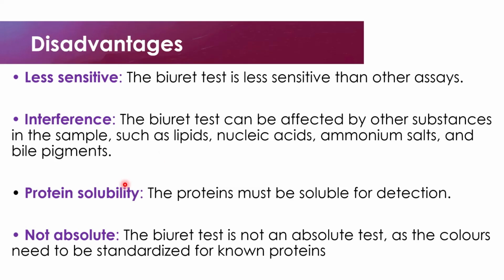Protein solubility. Over here, the protein that we want to use must be soluble for detection. And also, the Biuret test is not absolute. In this case, one important thing that we have to note is that the Biuret test is not an absolute test, as the colors need to be standardized for known proteins.